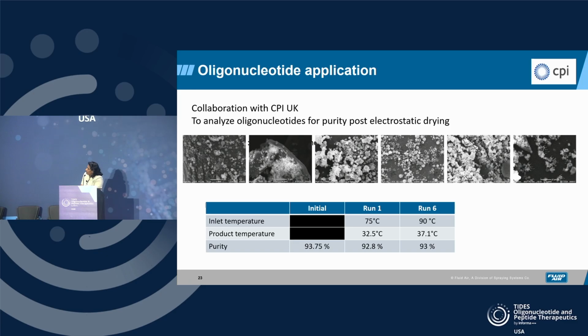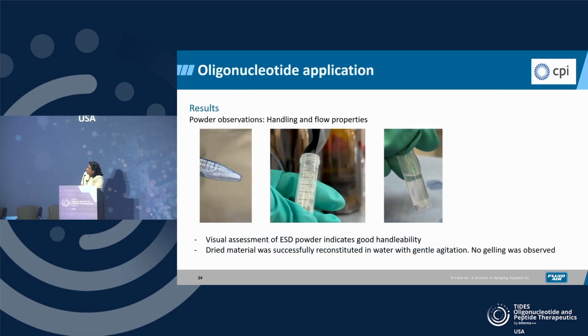of the oligonucleotide. The goal was to show that there was good handling and flow properties, and during dissolution there was no gelling. So those videos show that there's good flowing in the powders and no gelling seen.